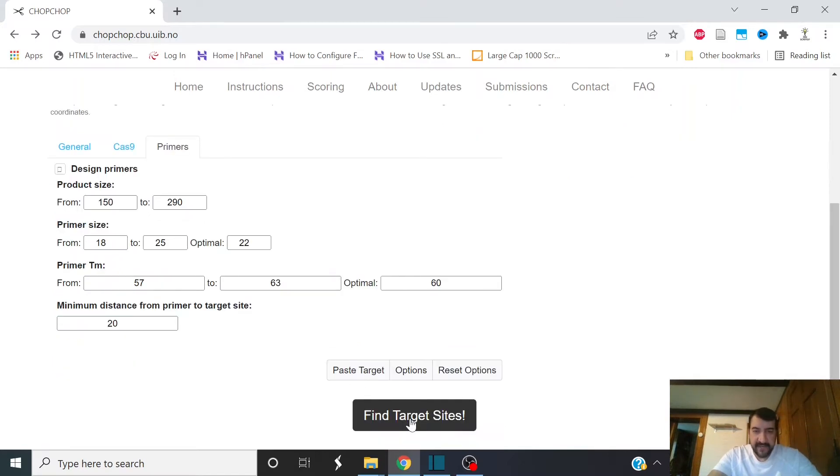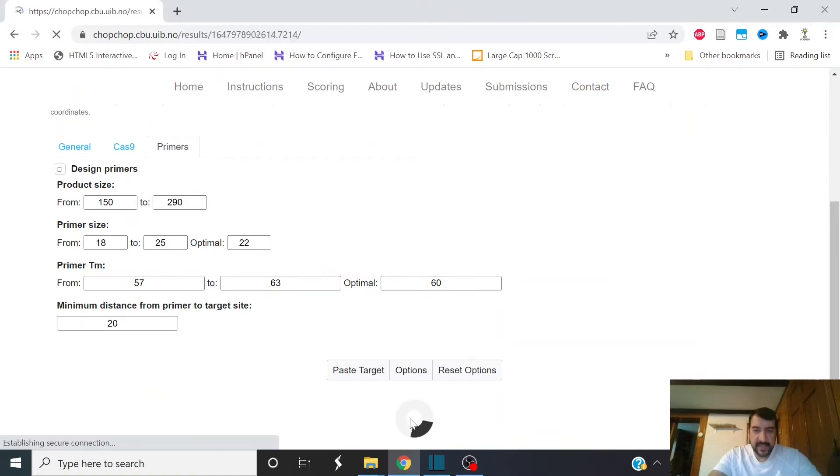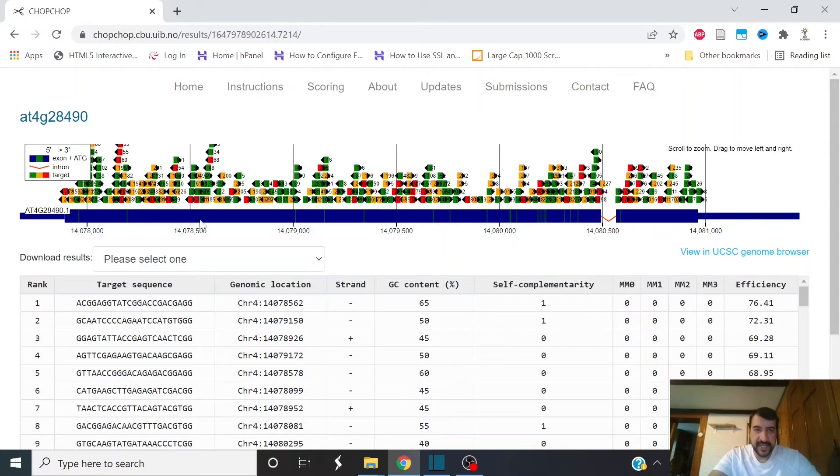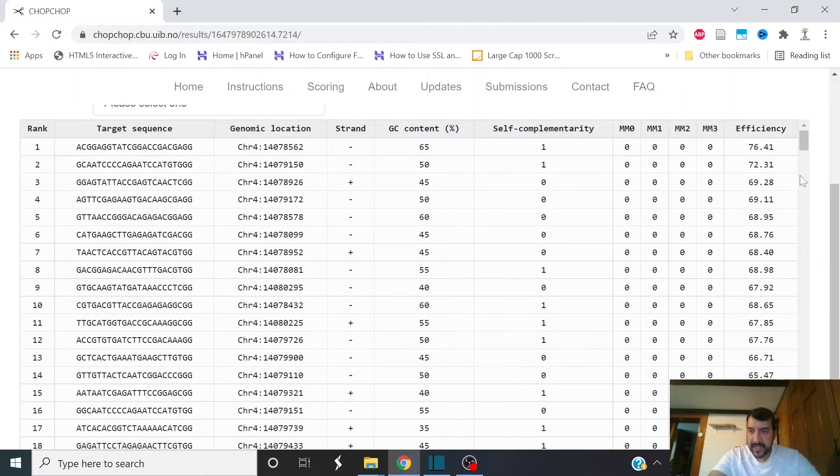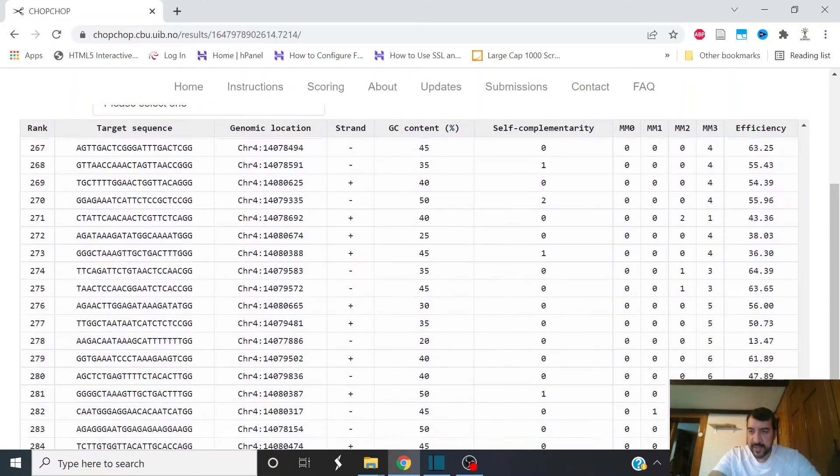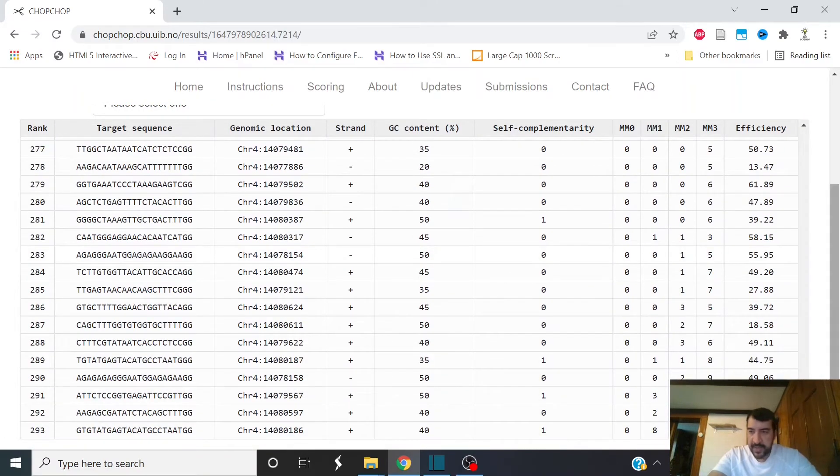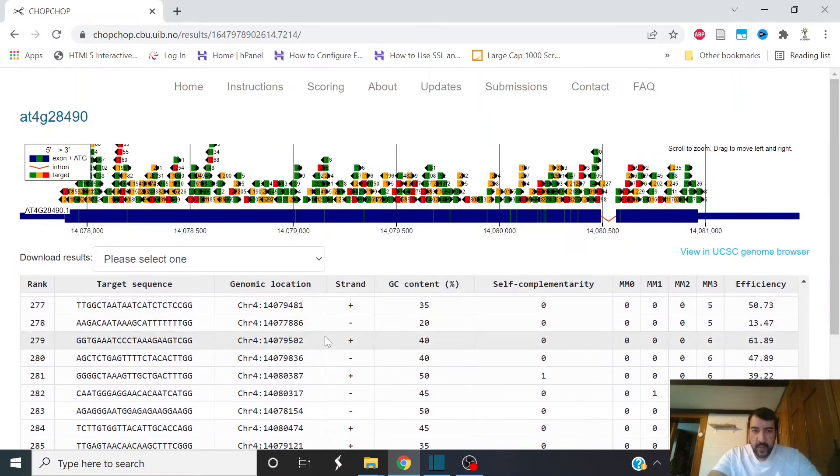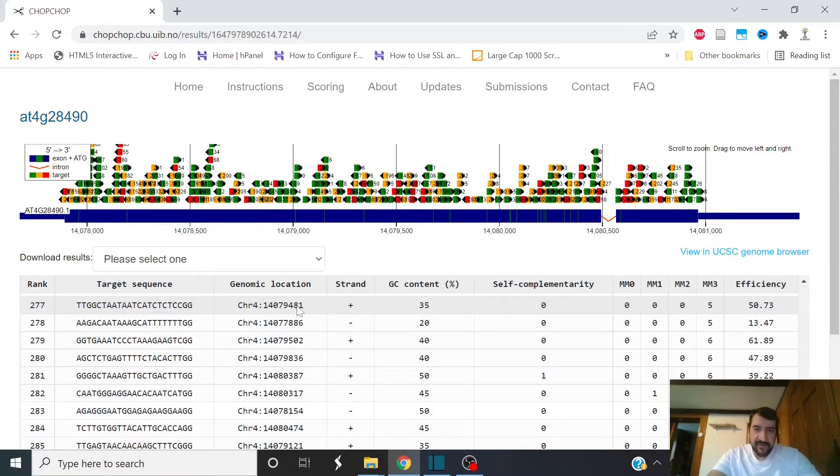Then click Find Targets. And here you can see all the potential guide RNAs that ChopChop has found in my gene, the two exons that are in my gene, actually found 293 guide RNAs. And they're ranked according to a number of criteria that ChopChop uses.